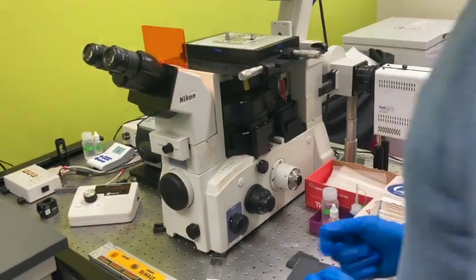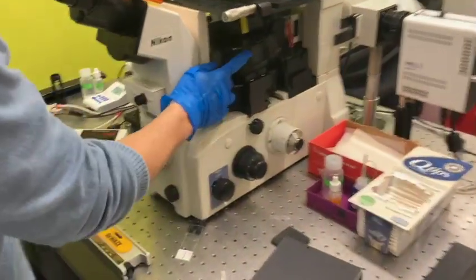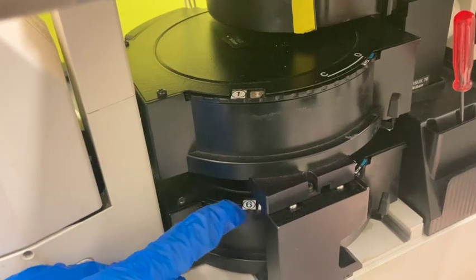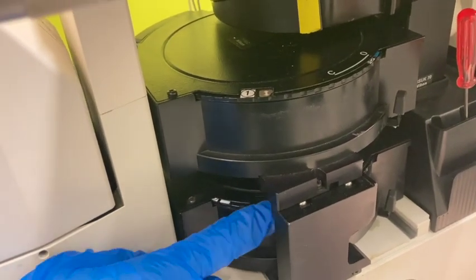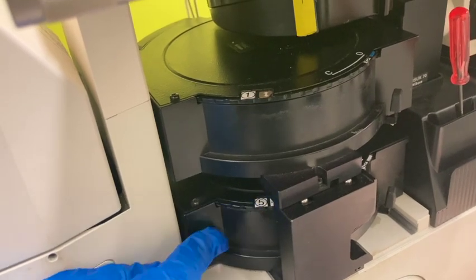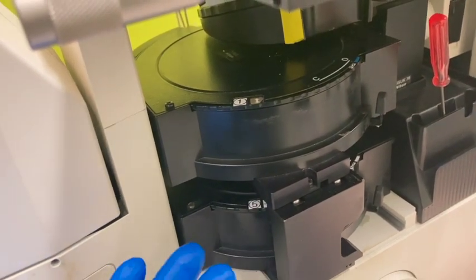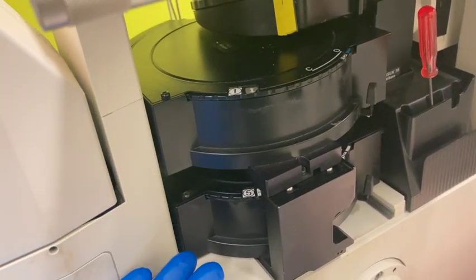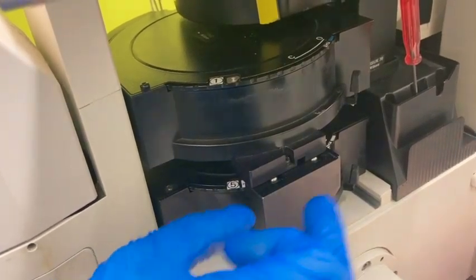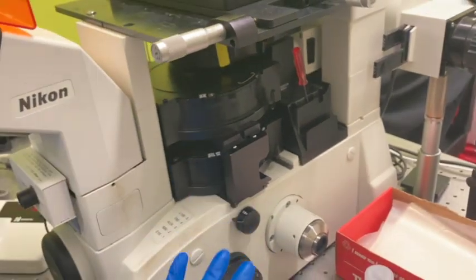And then this is set to 1, which is right. However, the filters down here need to be set to 5. So when we are doing IRM for microtubules, we set it to 5, and in that cube it's empty, nothing is there.